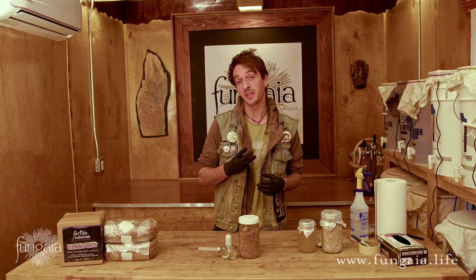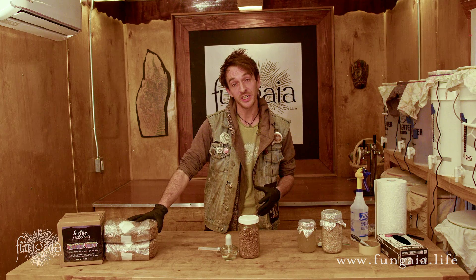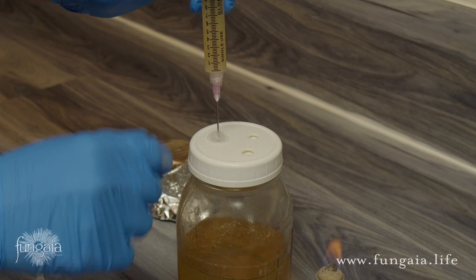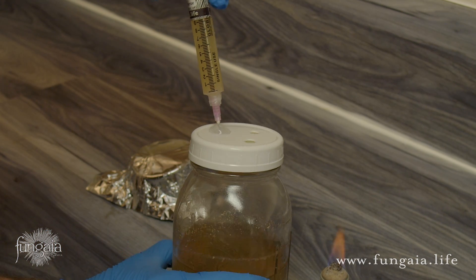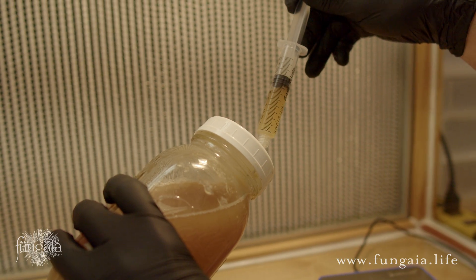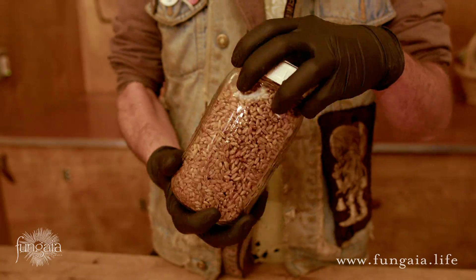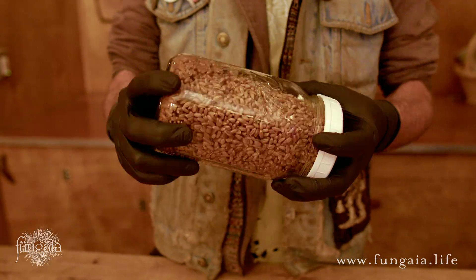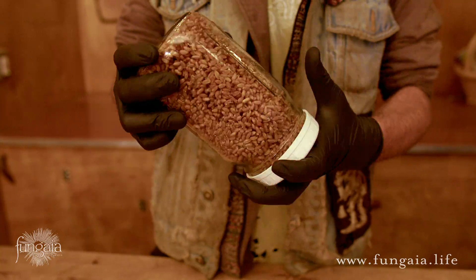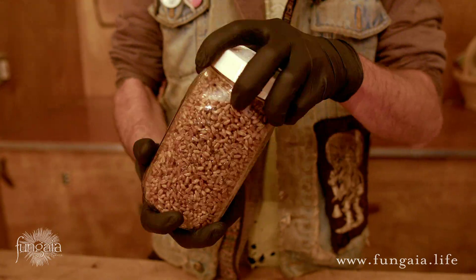For best results, I recommend using about 3ml of liquid culture per jar and a full 10cc syringe for a 3-4 pound bag of grain or an all-in-one bag. Check out my video 'How To Make Liquid Culture The Easy Way' for a simple method to expand one liquid culture syringe into many, so that you don't have to worry about using too much. Shake each jar for a full minute or two to distribute the liquid culture as thoroughly as possible — I rock the jar side to side and twist a little each time. Taking some extra time for this now will cut your incubation time in half.